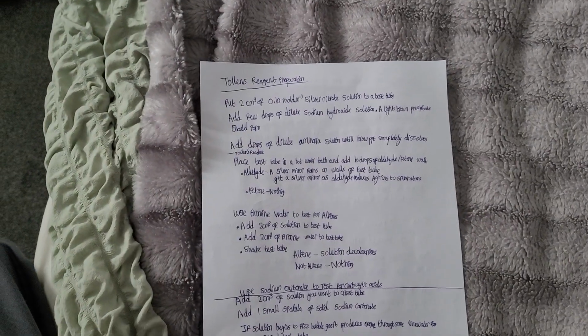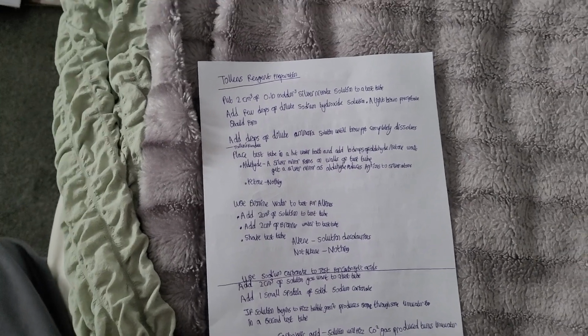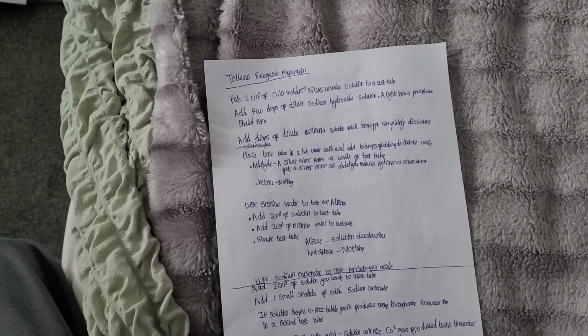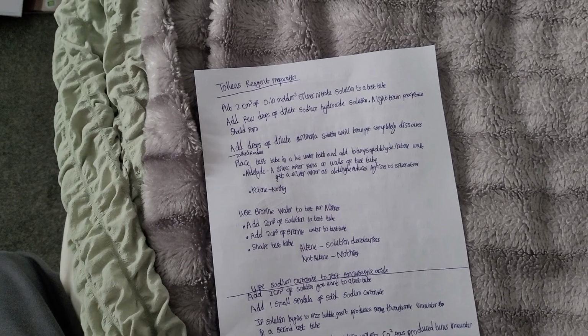Tollens reagent preparation, and how to use it to identify whether a compound is an aldehyde or a ketone. First, put 2 cm³ of 0.10 mol dm⁻³ silver nitrate solution into a test tube. Add a few drops of dilute sodium hydroxide solution. A light brown precipitate should form.